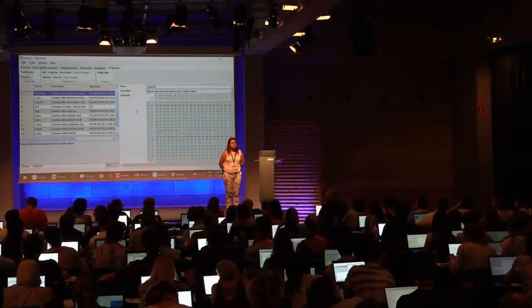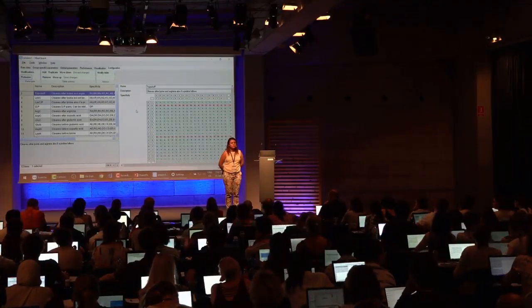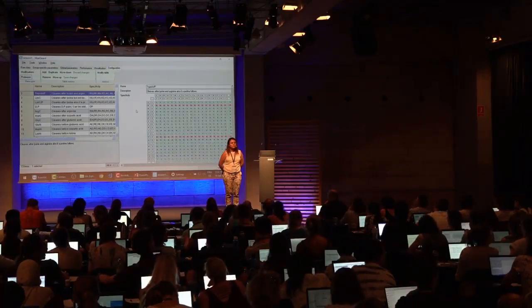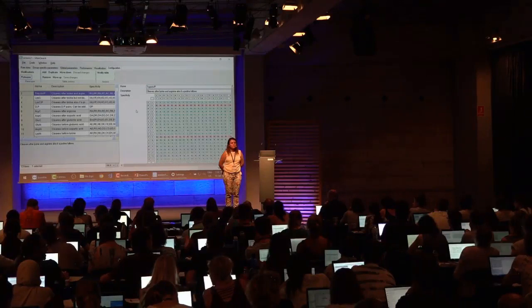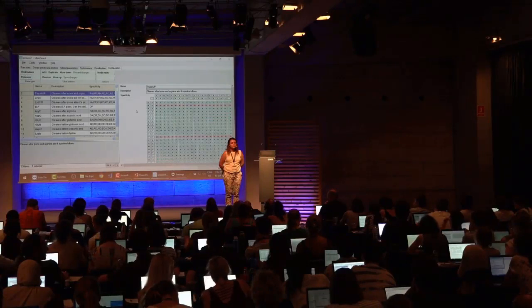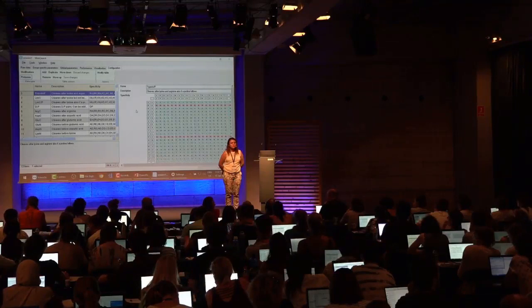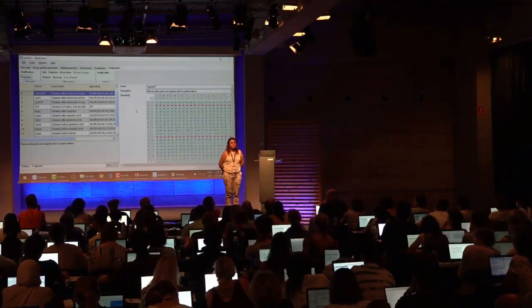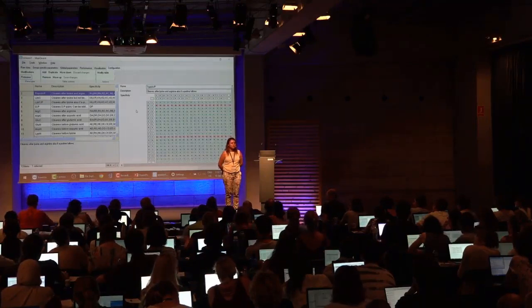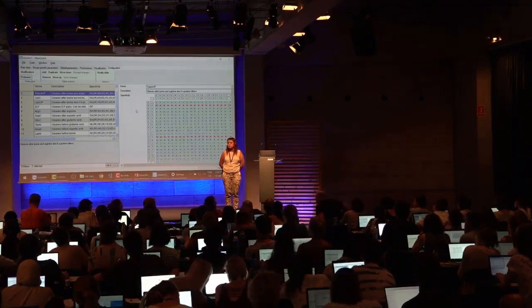The default is trypsin P. Yes. We have searched a number of data files, and actually we don't see many cleavages KP, RP. I was just wondering why this was chosen as the default setting. I guess it's trypsin dependent, but in our experience, the default would be trypsin, not trypsin P. Well, I think most of the searches by society we use trypsin P, but Jürgen, do you want to comment? Microphone?